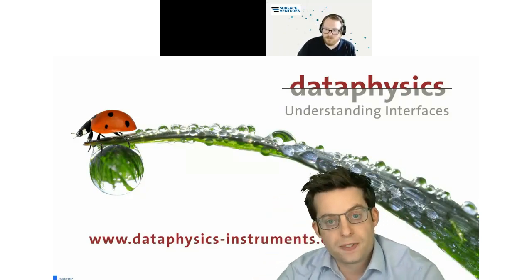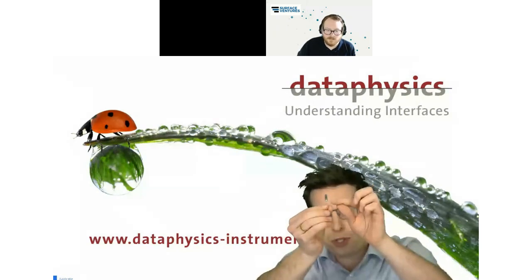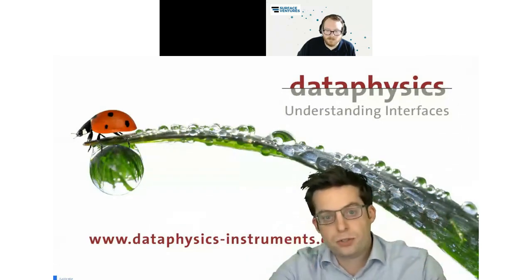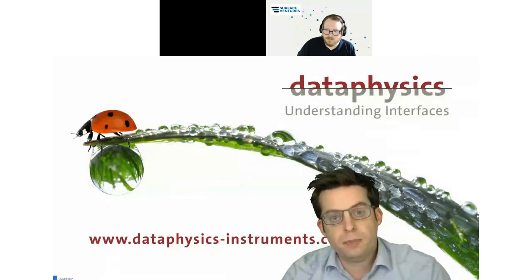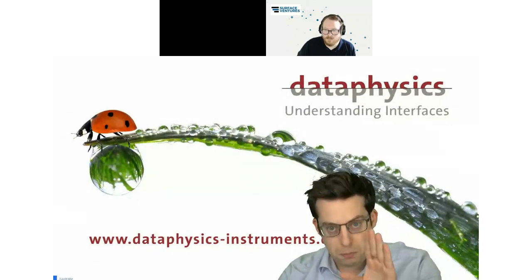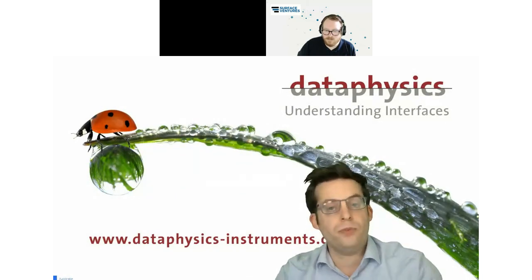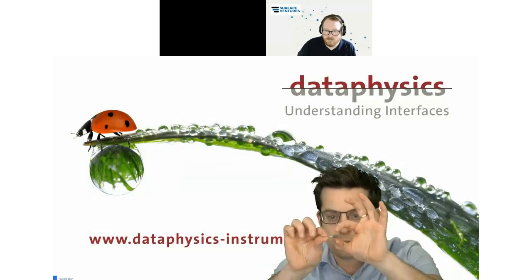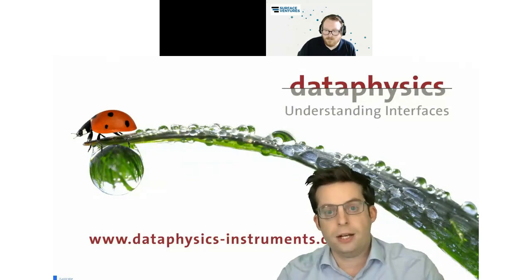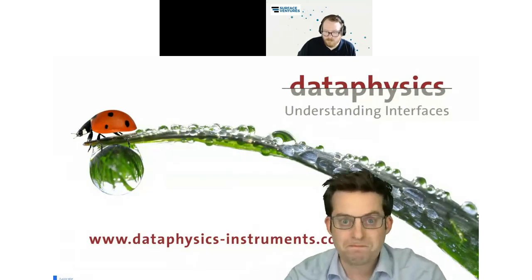You have seen I had to type in the wetted length, and typically we take the wetted length in an area where we have a cylindrical shape. So this means I need to dip it in at least 8 millimeters so that I have 3 millimeters in this linear area here. But of course, there are still the screw turnings on the surface. So we always just determine the outer diameter here, and we neglect that there is a screw geometry on it.